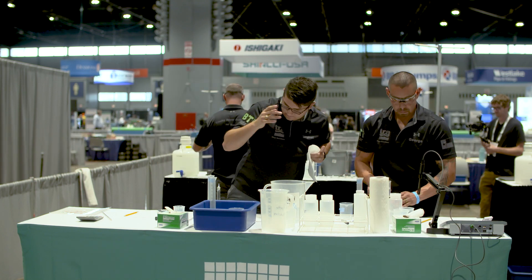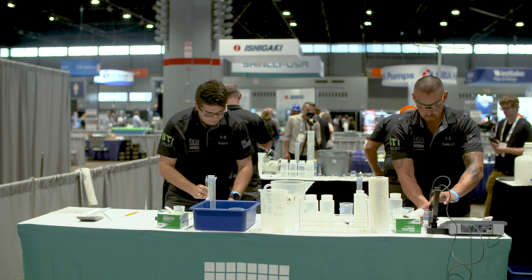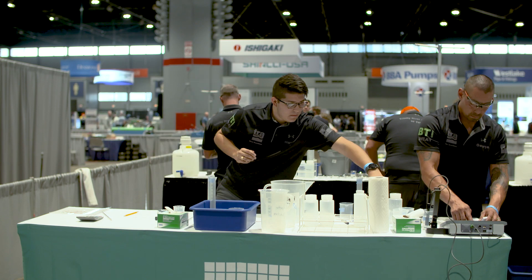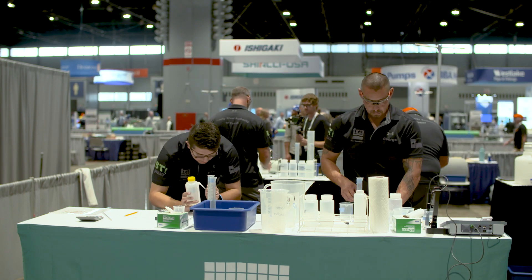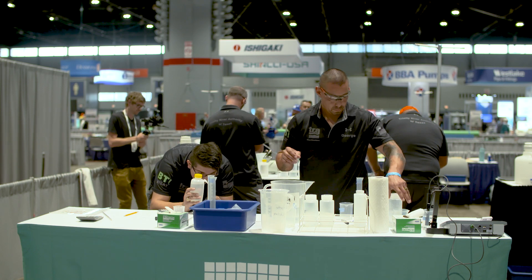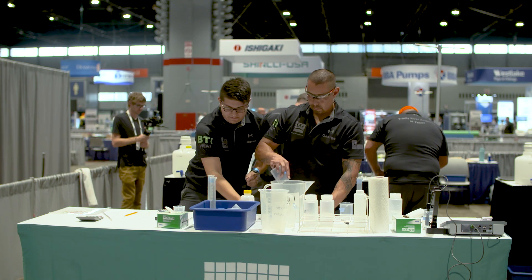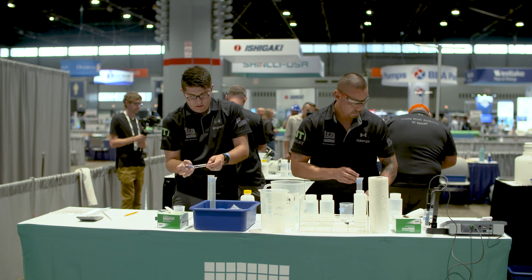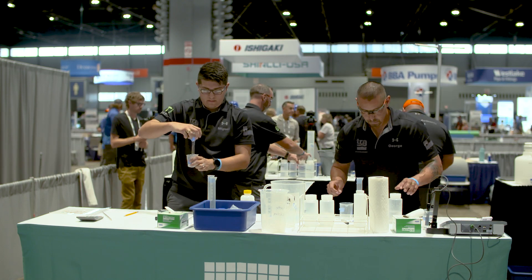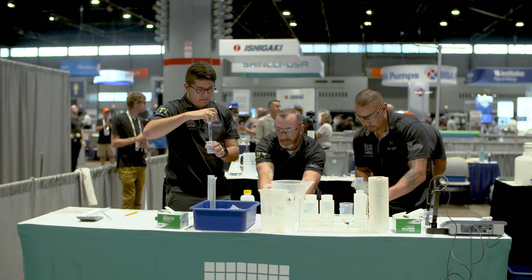Be careful with these volumetrics — they are breakable glass. When you put them in the dirty glassware bin, if there are two of them and you throw them in, you may break them. You will be penalized if you damage the glassware, so take your time and sit them in there gently. The rest of the equipment is plastic, but with the two volumetrics, please be careful.